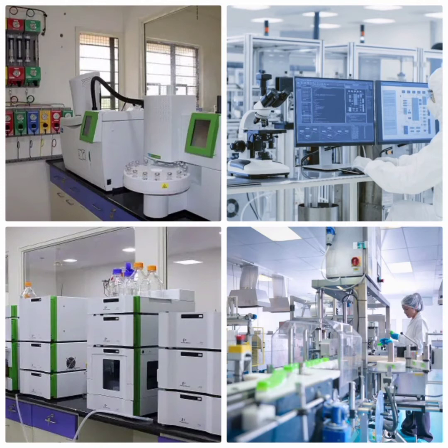On the other hand, compounds separated on HPLC have high molecular weights ranging from a few hundred to several millions for large polymers and biomolecules. Such compounds can be analyzed at room temperature only, because at elevated temperature they tend to decompose or degrade.